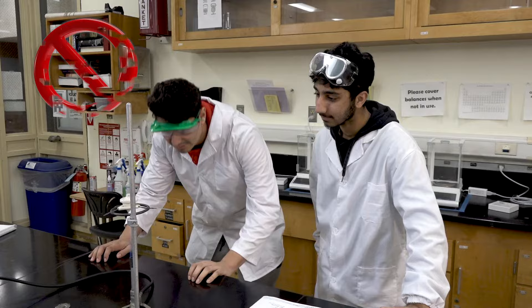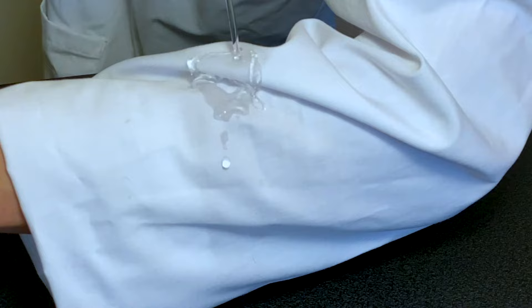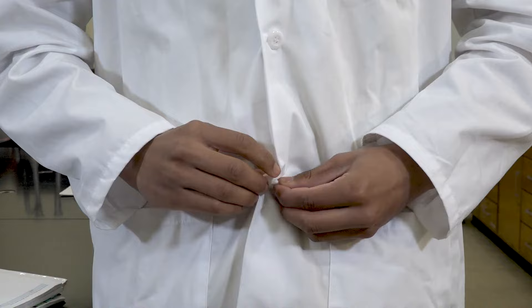Your lab coat will serve as the first layer of protection against spills. Make sure to keep your lab coat buttoned during the entire lab period. Make sure you're dressed properly for every lab period.